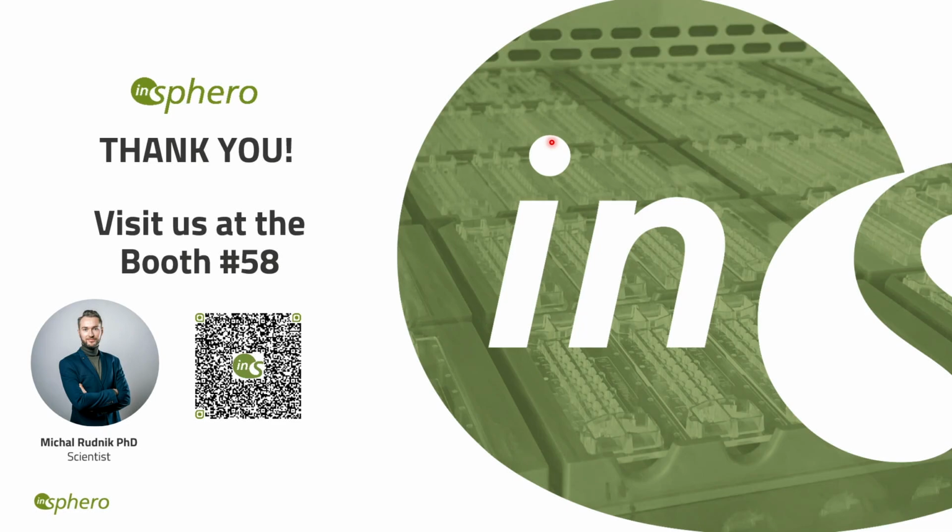Okay, good points. I was wondering, what if in the merging channel you were to include some sort of barrier that would limit the size of what can go through in the connecting channel? So maybe also a consideration for future development, with and without that, would allow you to discriminate cell migration. Yeah. All right. Thank you.